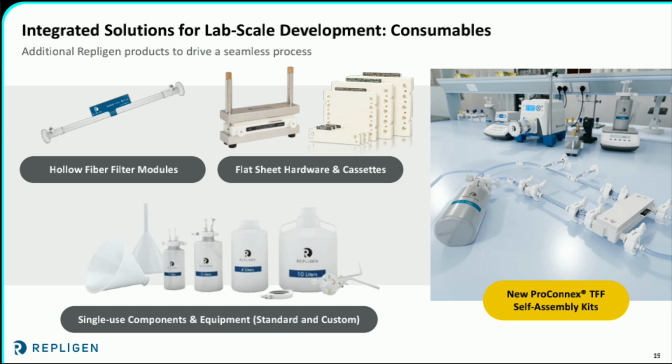Also, Repligen does not just sell systems. We also have a lot of consumables that we have available on the market. So what you'll see today is us performing a UFDF process using one of our Tangential flat sheet cassettes. We've got flat sheet cassettes in a wide range of sizes, of pore sizes, as well as surface areas. And then we also manufacture hollow fiber filters as well. So if you need hollow fibers for your materials, they're definitely available through us as well.